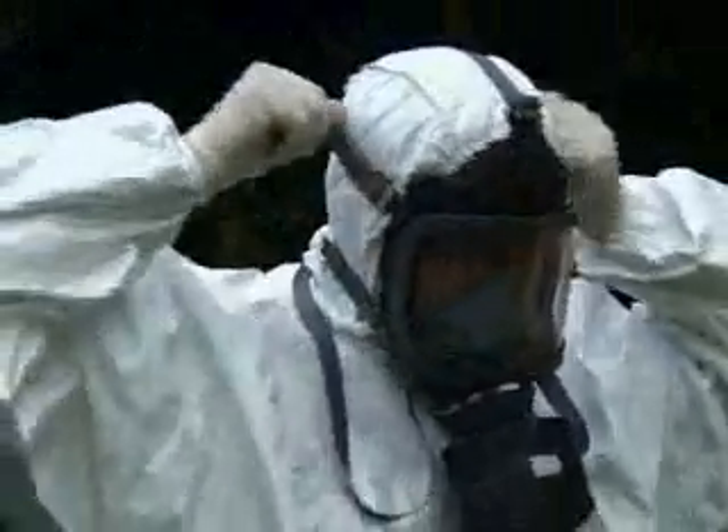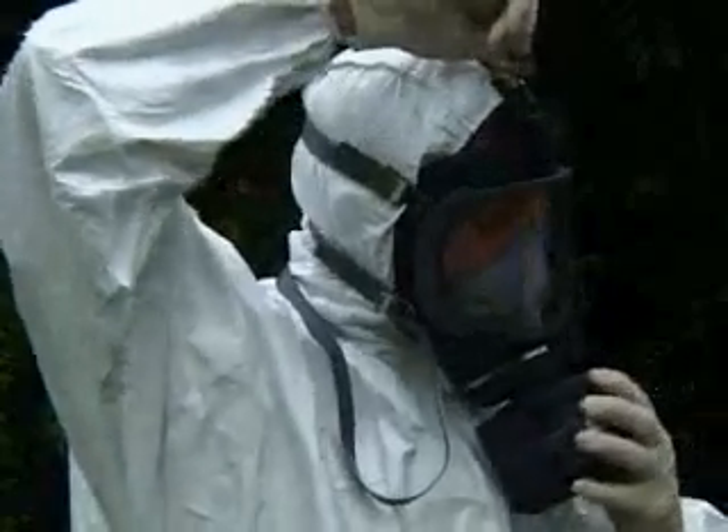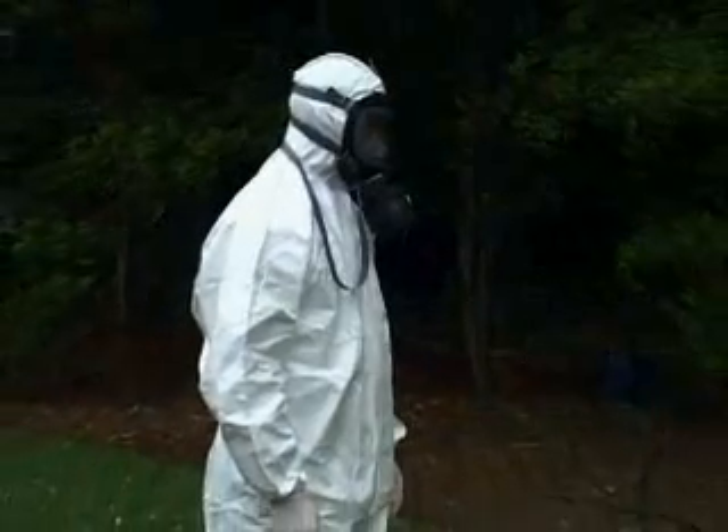In this experiment, four types of protective suits are tested, along with three different respirators. In all cases, a white inner suit is used, so that any leakage through the outer suit will show up clearly.